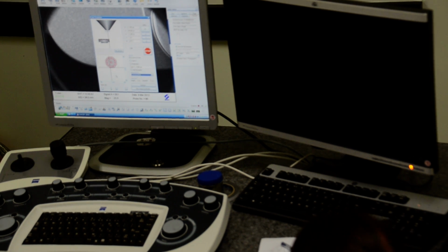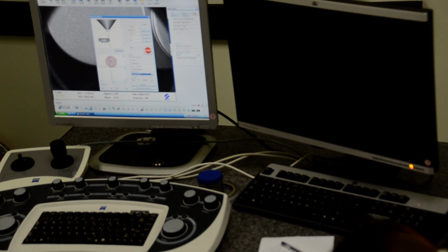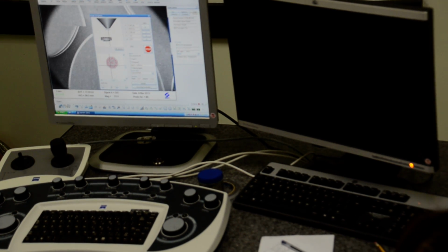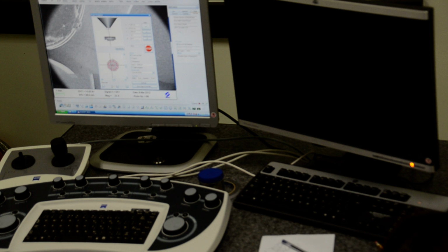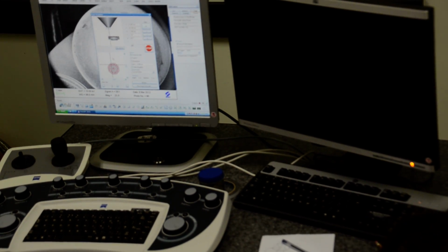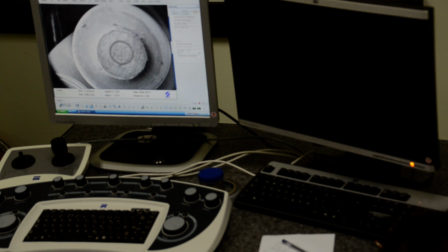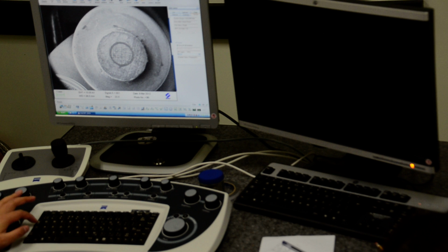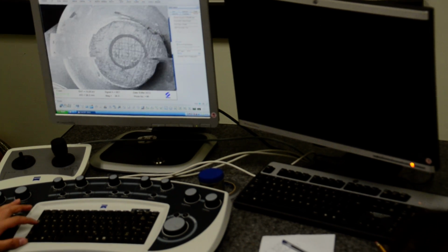I think just now I put my sample at position 4. You just double click it. Yep. So it's easy to find a sample. So it's a gold carbon sample.